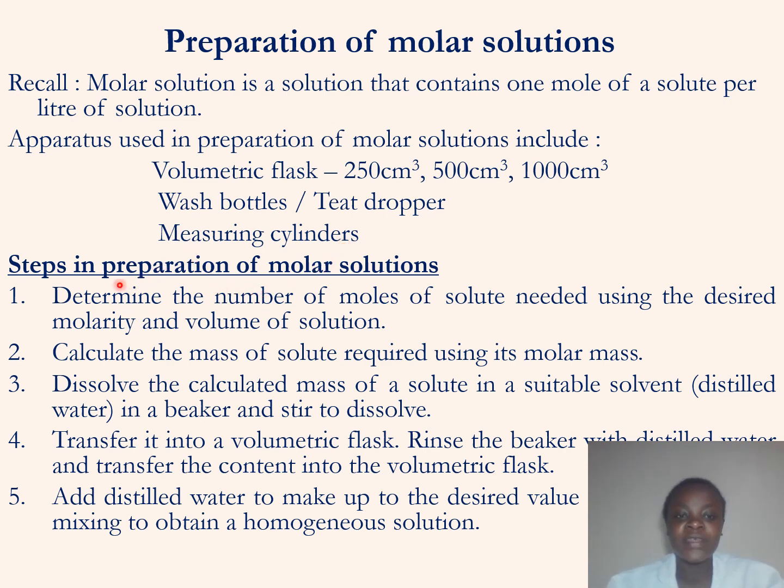So let us get to the preparation, and we start by looking at the steps that are followed during the preparation of molar solutions. Any molar solution must follow these 5 steps.